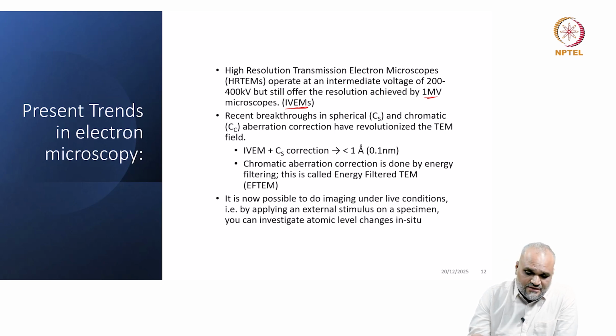And there's another new trend coming up where people are modifying the microscopes a lot. For example, there is a large drive to look at ultrafast electron beams in the microscope, where you're reaching femtosecond level electron pulses to get information from samples at extremely controlled doses.